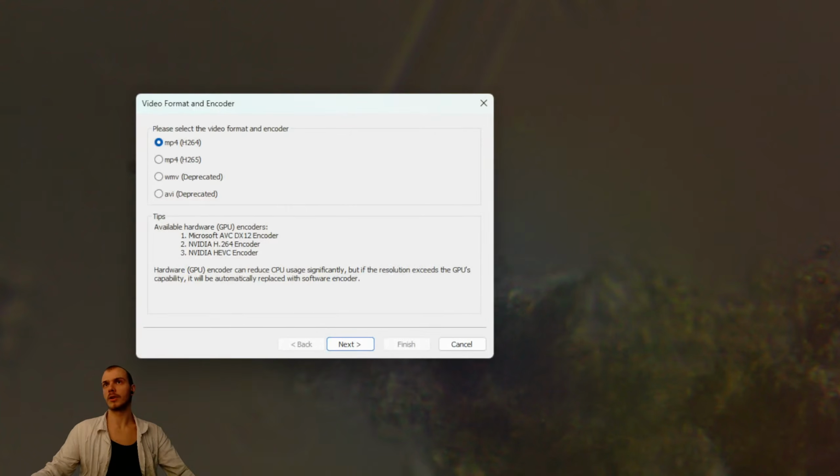Where was it? Here. But that's probably too some bacterial colony. Yeah, that's a bacterial colony. You see there are multiple cells here, which are really small. I will record this one.